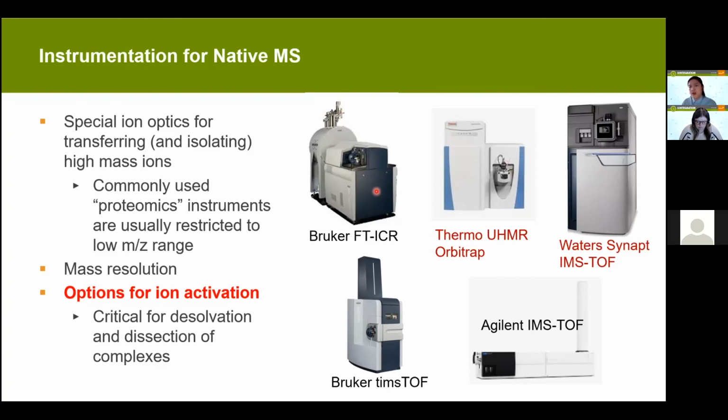Usually here we use on the order of 1 micron up to 10 microns. It also depends on what you want to do and what proteins you are looking at. Some of them are very sensitive, the spray may be sensitive to the size of your tip. Some of them, if they're very clean, tend to be okay. They seem to be fine for any size you're using.